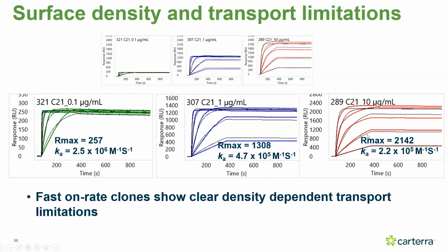This was an extremely mass transport limited system shown here. But by titrating it down, even not to really low levels, but just to moderately low levels, we're able to generally overcome that. This was with a 63 kilodalton protein. And all of these 3 sensorgrams you see are seeing the same injection of antigen. You know, this isn't a dilution error or something. This is actually in the same flow cell, the same antibody at different densities.